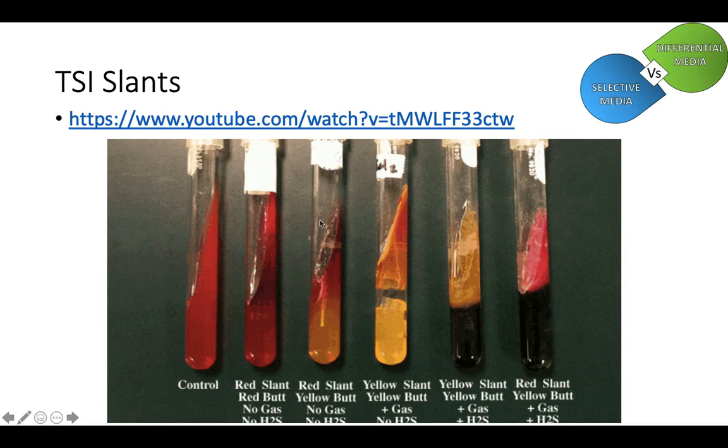Protein fermentation, or hydrolysis, excuse me, does best in the presence of oxygen. It's an aerobic process, so it doesn't do very well anaerobically. So this species, 5 or 6 hours into his life, ran out of glucose. Instead of starving to death, he just started hydrolyzing proteins. He couldn't eat the lactose, he couldn't eat the sucrose, so he started hydrolyzing proteins. And that's pretty neat here.